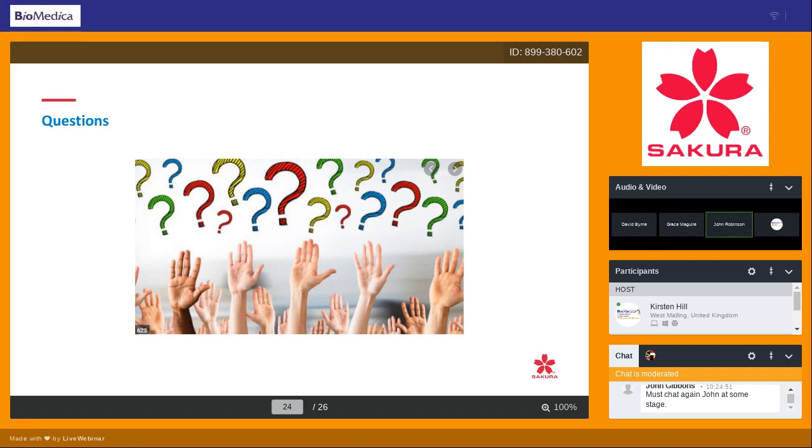How much time would this save in the lab? Again, it's a robotic assistant, Adele. It's preventing somebody having to stand and load the Express or unload it, or stand and wait on the automated embedder from an unloaded conventional processor. It's also unloading the Express and reloading the A120 and then unloading the A120. So the time that it saves is basically the time a person, a histotech, would have to stand in front of their machines and physically move magazines from door to door.